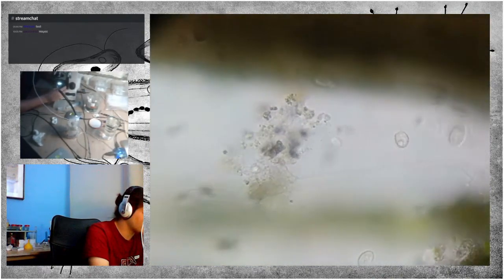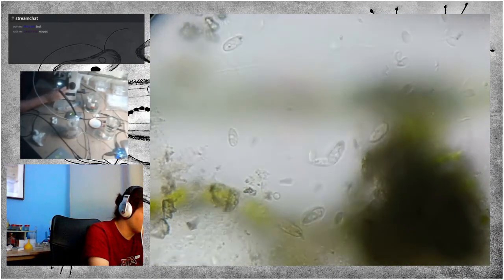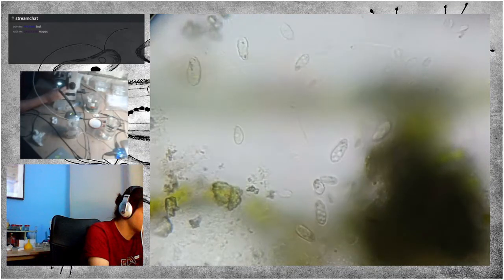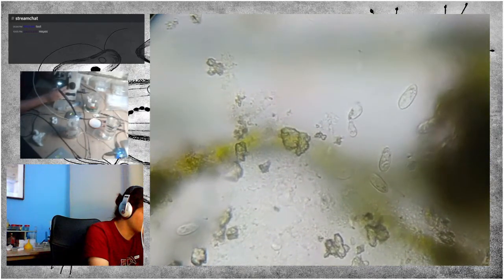Oh, here are more microbes. Again, here are two ciliates in the middle of conjugation. A little more about the conjugation.